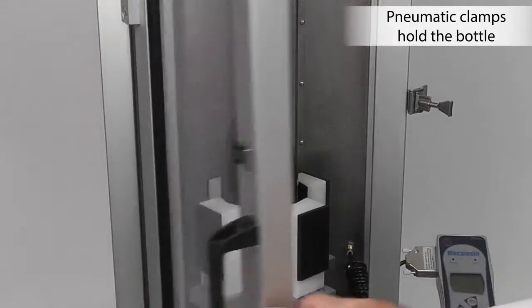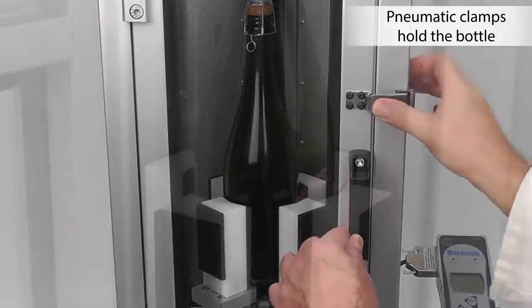Testing time is kept to a minimum by using pneumatically operated clamps to secure the bottle.